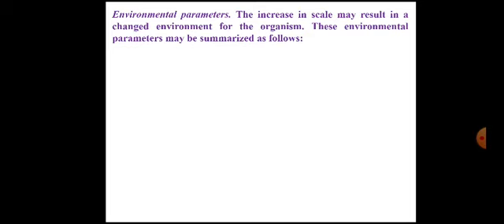Scale dependent factors involve experimental environmental parameters. So an increase in scale results in a changed environment. Environmental parameters change with respect to the volume, with respect to scale. That is why it is a scale dependent factor.